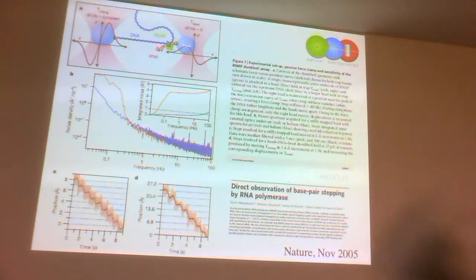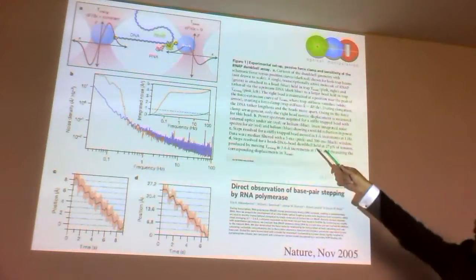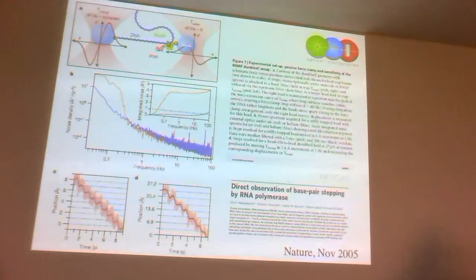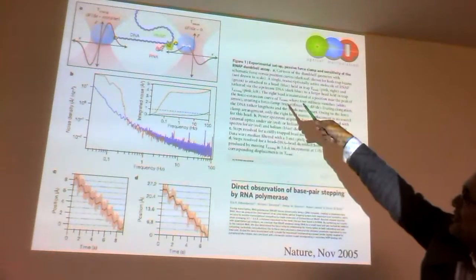Okay? Remember that dispersive signal, we've got a force. As you go to the edge, there's a turning over point. See where they've located the bead? At that point, the bead just wiggles. It's just pulled, but it wiggles. And there, K-trap is zero, because the gradient's zero. So that's how they do it. Do you see that?